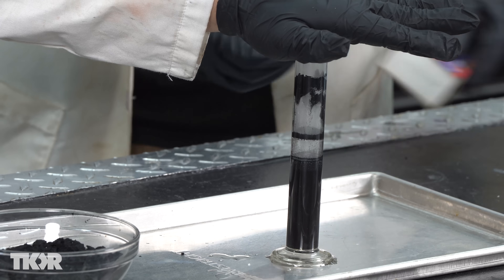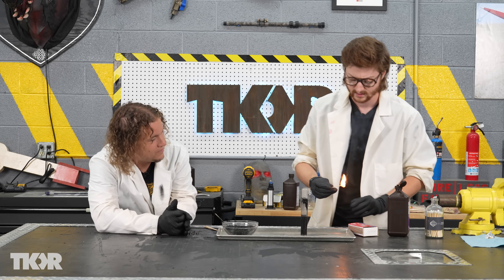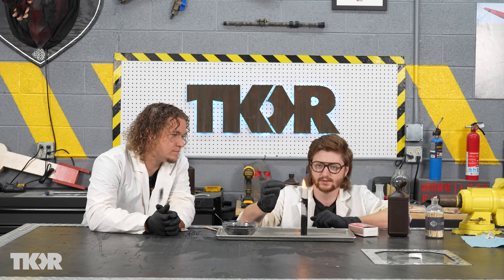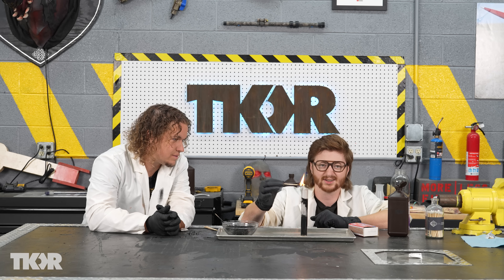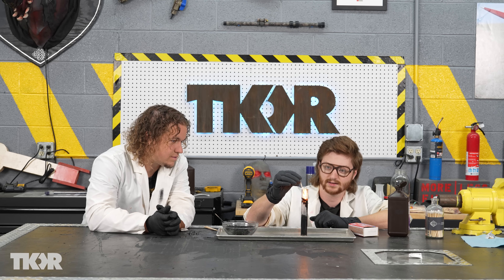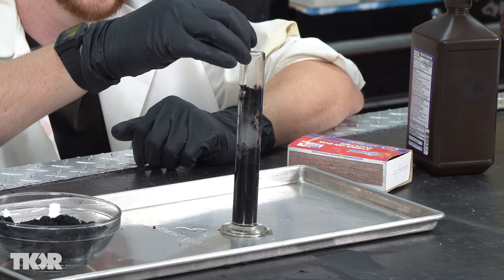To prove that this reaction is creating oxygen, let's take a match and see what happens. Let's let it burn down a little bit. See what happens if we put the match over it — look at how it immediately gets brighter. Oxygen, of course, drastically increases the rate of combustion. Look at it glowing in there.